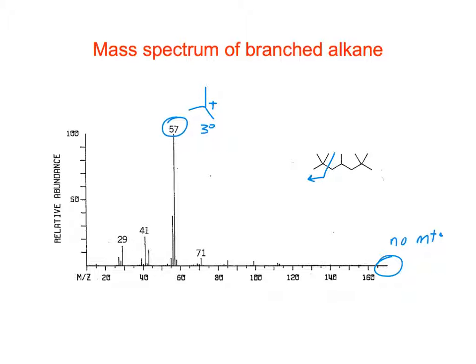All right, so the next thing has to do with what you guys were talking about already. This isn't really the best spectrum to look at for it, but notice that all of these ions have some other peaks that surround them, right?